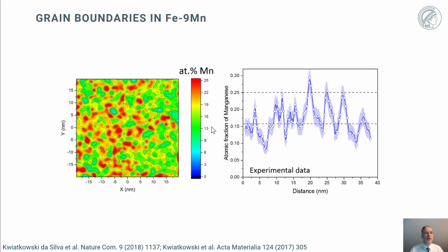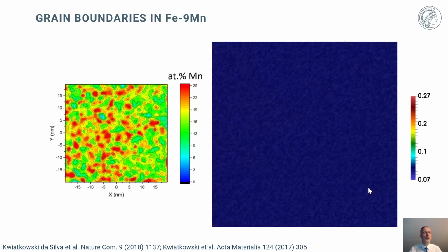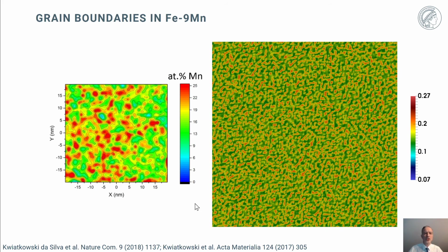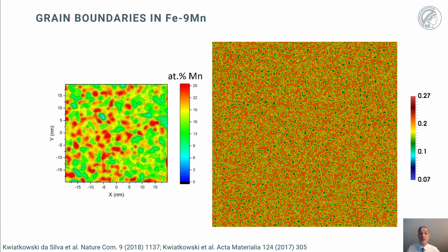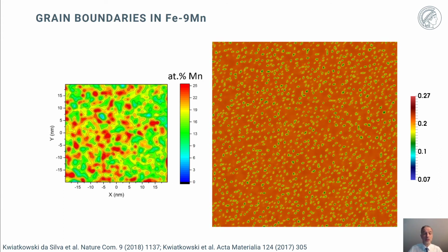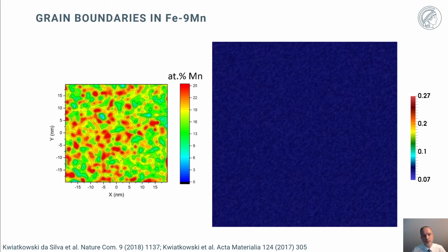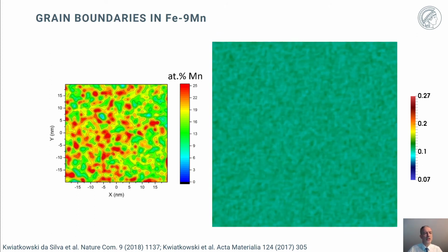And when you cut with an arrow through such an experiment, you get again similar variations as we have seen before on single dislocations. And we have cast this into a phase field calculation, which shows with the corresponding boundary conditions applying to the grain boundary region, you see indeed that you get such decompositions also predicted from the phase field simulation.